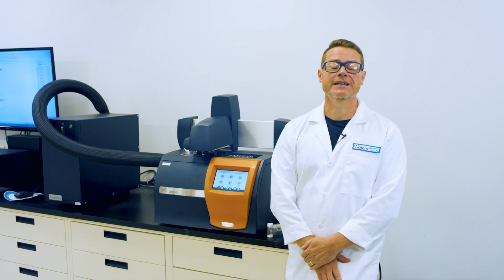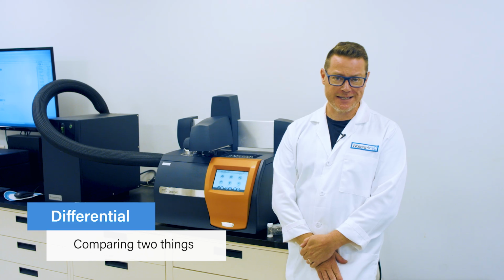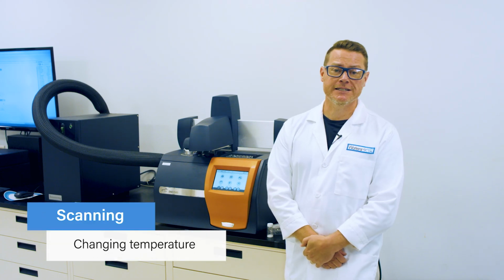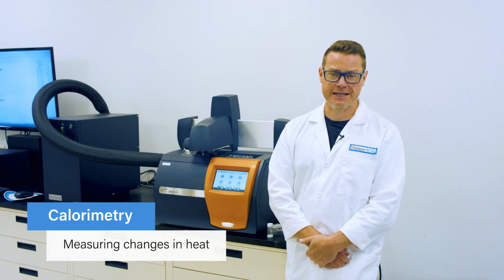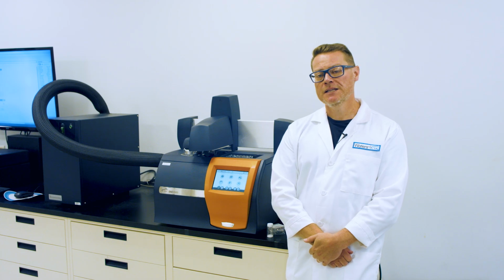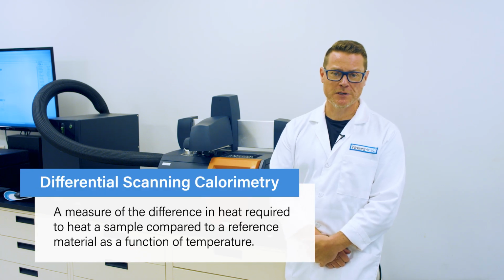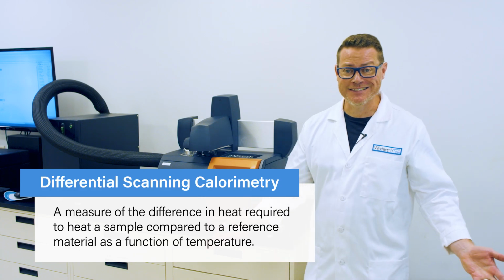The clue is in the name. Differential means we are comparing two things, in this case a sample with a reference. Scanning means we are changing temperature, and calorimetry means we are measuring changes in heat. Summarising that then, in DSC, the difference in power needed to raise or cool sample and reference materials between two temperatures is measured. And that's all there is to DSC.